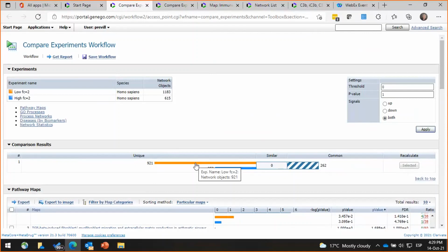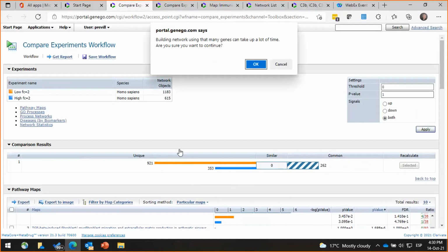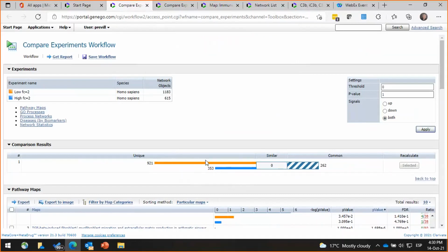One is if I right-click here, I can sort this results specifically for this low infiltration set. And I've already got that prepared in the next tab. The other thing I can do is left-click on here, and it will build a network around this set of genes as well. And again, I've already done that. So that's what I'm going to take us through now.